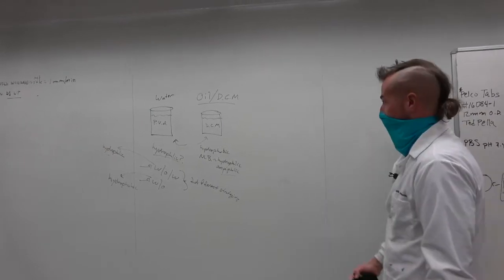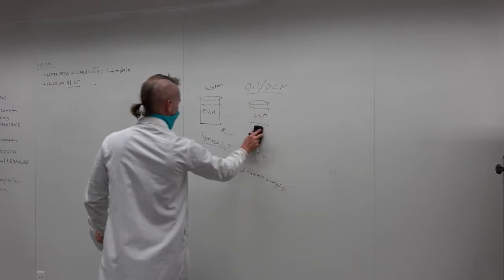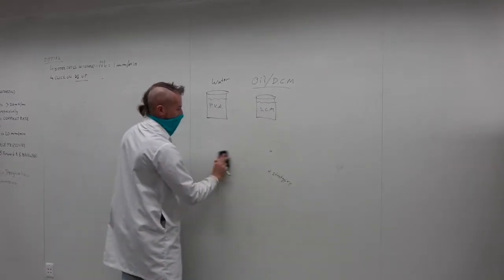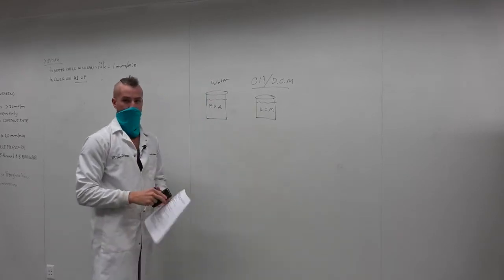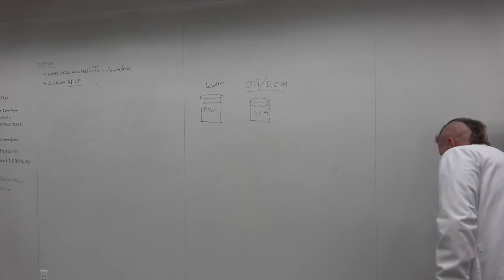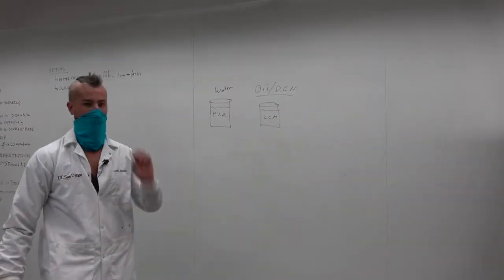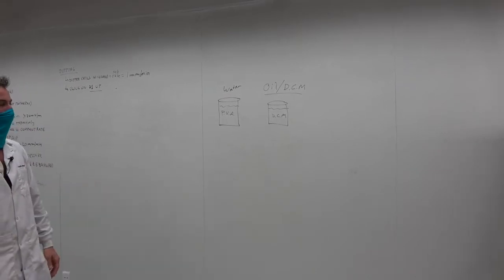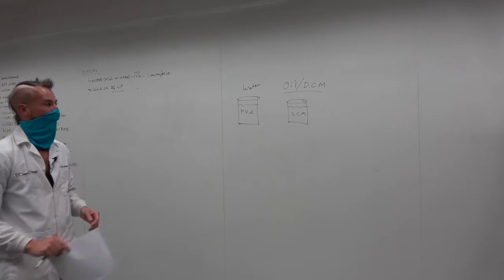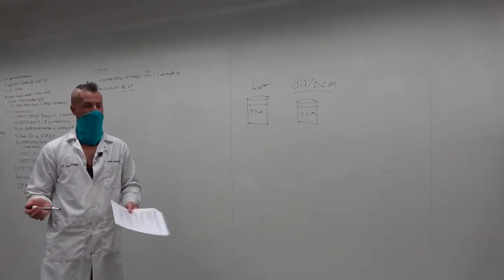The other thing, okay, so once we have these, we have our oil, we have our vinegar. Now we've got to shake them up, right? And I talked a little bit in the lecture on Canvas about the effect of free energy and how free energy governs particle size. So I'm not going to talk a lot about it here, except to tell you mechanically the two different methods that we're using.